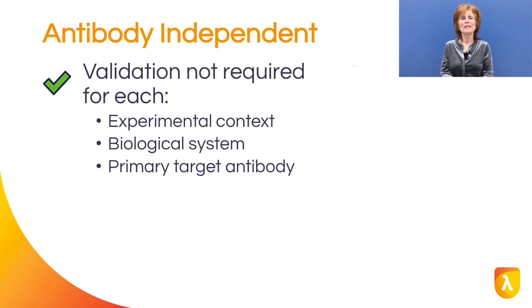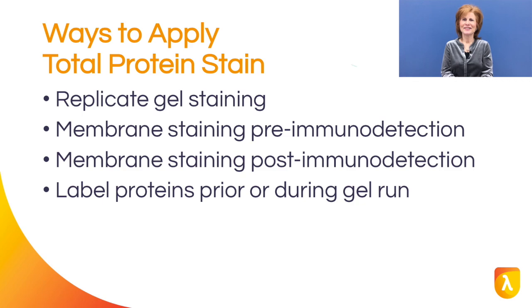However, the total protein staining itself is antibody independent and does not require validation for each experimental context or condition, the biological system, and primary antibody. There are several different ways to apply this method.